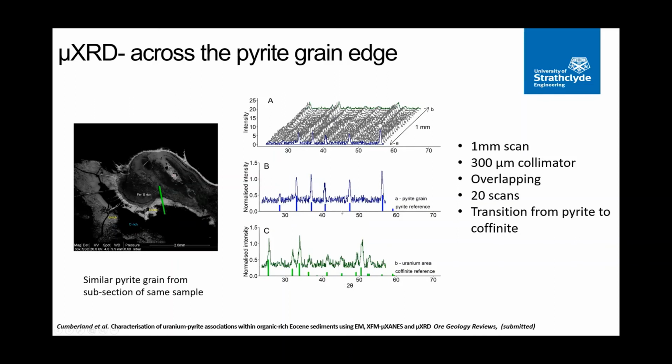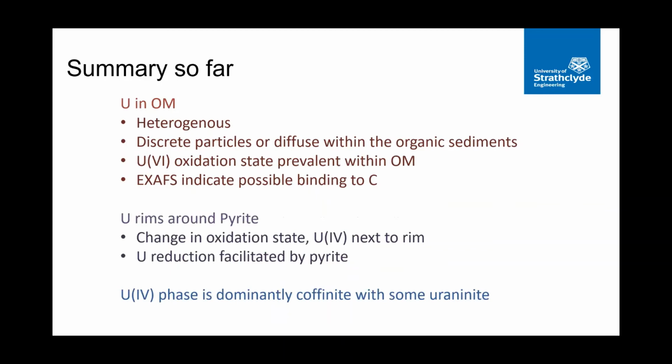Between the first and last scans, there was a gradual transition, with one being pyrite and the other fitted to coffinite, which agrees with some of the other data that's been produced. So I can summarize that so far.